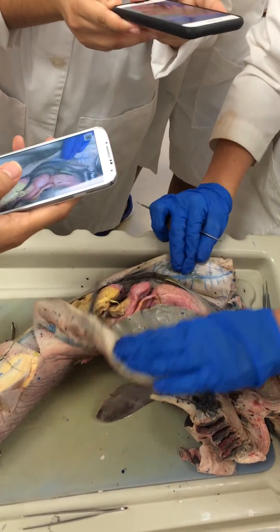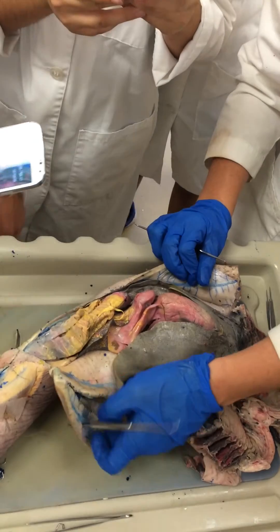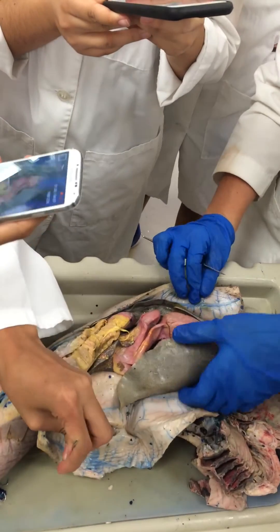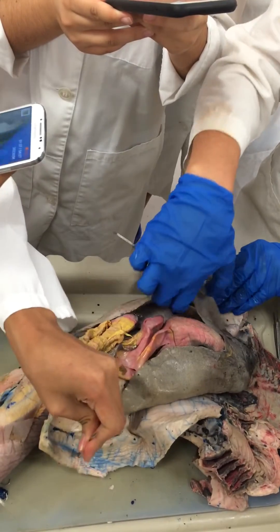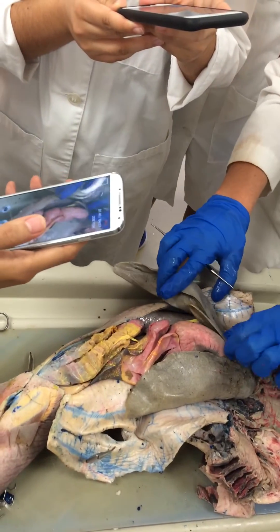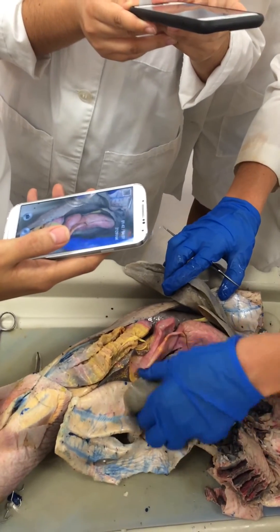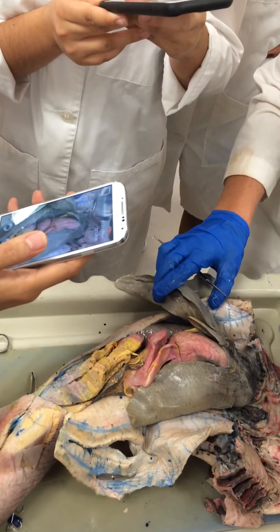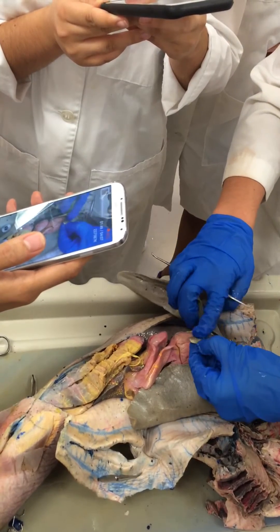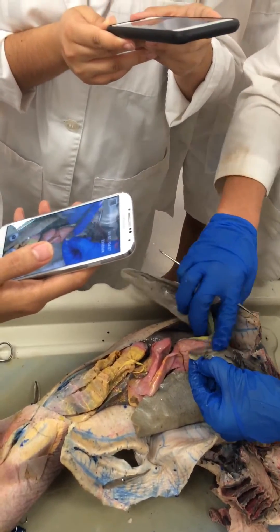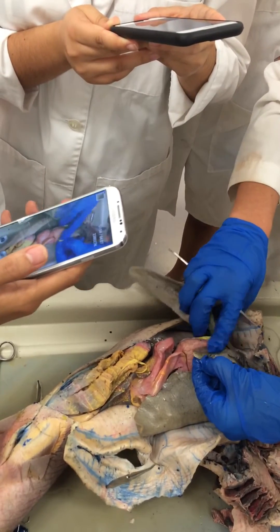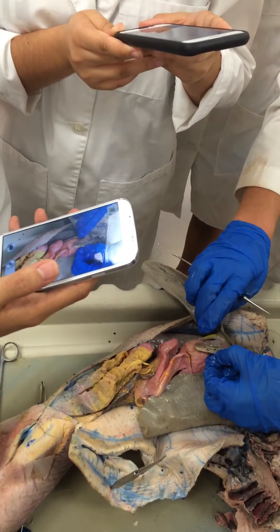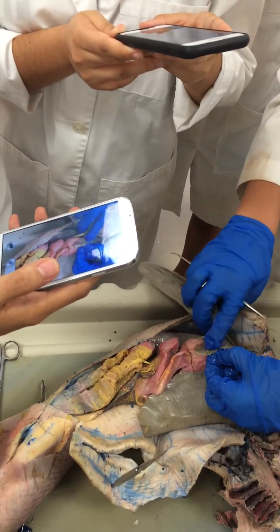As we open up the shark, the most obvious thing is the liver. We have the right lobe of the liver, the median lobe of the liver, and the left lobe of the liver. We have this falciform ligament running down the middle of the median lobe. This flattened section that oftentimes has a green tint to it is the gallbladder. I'm not going to ask you to identify the bile duct because it's usually too difficult to see, but just know that the gallbladder is here.